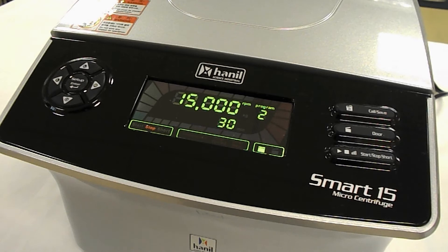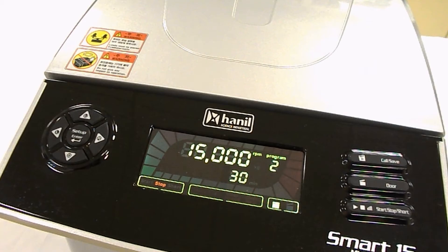We're going to show you the Smart 15 today, which is Hanil's most popular microcentrifuge. One of the coolest features of the Smart 15 is the flexibility to be really specific with each and every setting, from the RPM values all the way to the timer. Along with being able to precisely change each and every single value, the Smart 15 also offers programmable settings, meaning you can have up to 10 different profiles based on the type of sample you're planning on spinning.